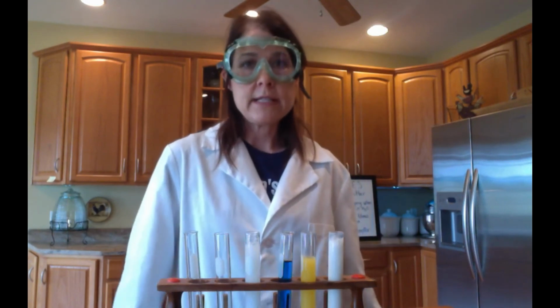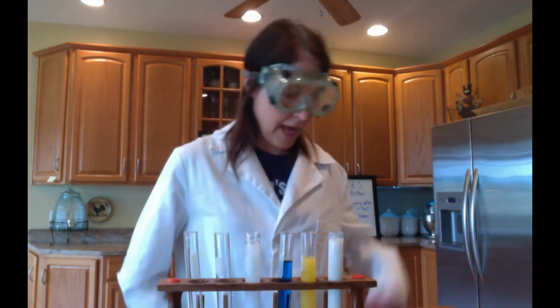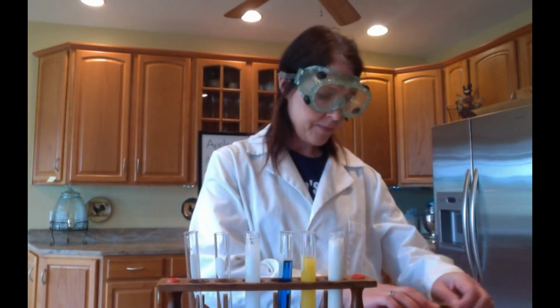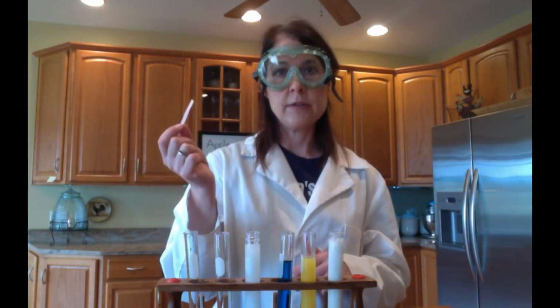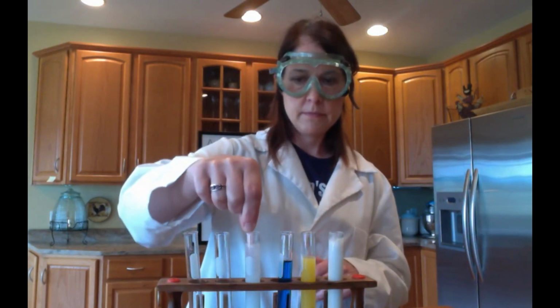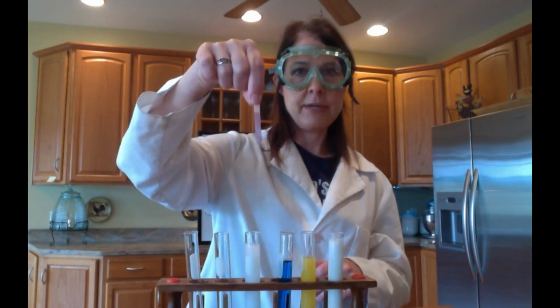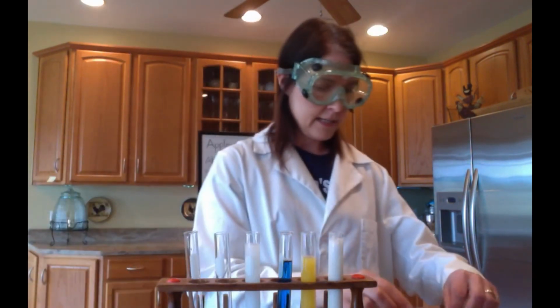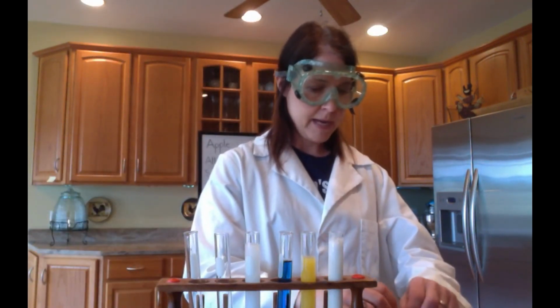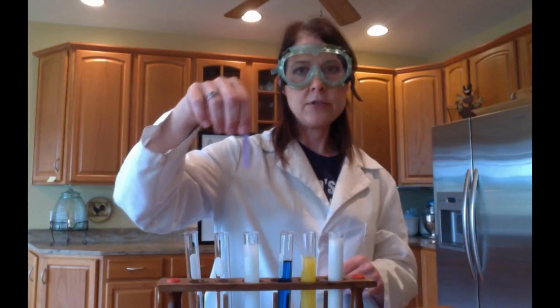So I'm going to test that with what color litmus paper? Okay, red. I'm going to take red litmus paper. If it's a base, this red litmus paper should turn blue. So I'll dip it in there and pull it out, and we definitely see that that is blue. Go ahead and test it with blue litmus paper. Dip it in, pull it out, we see no color change.